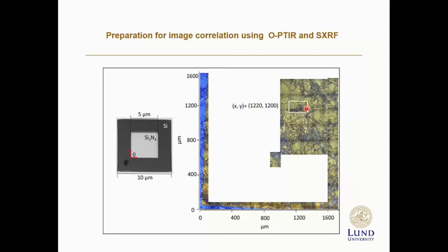We recorded the coordinates of those neurons. As an example shown here, we mapped these neurons, and then we could find the same corner using the two microscopes and, using the coordinates, we could go to the target.